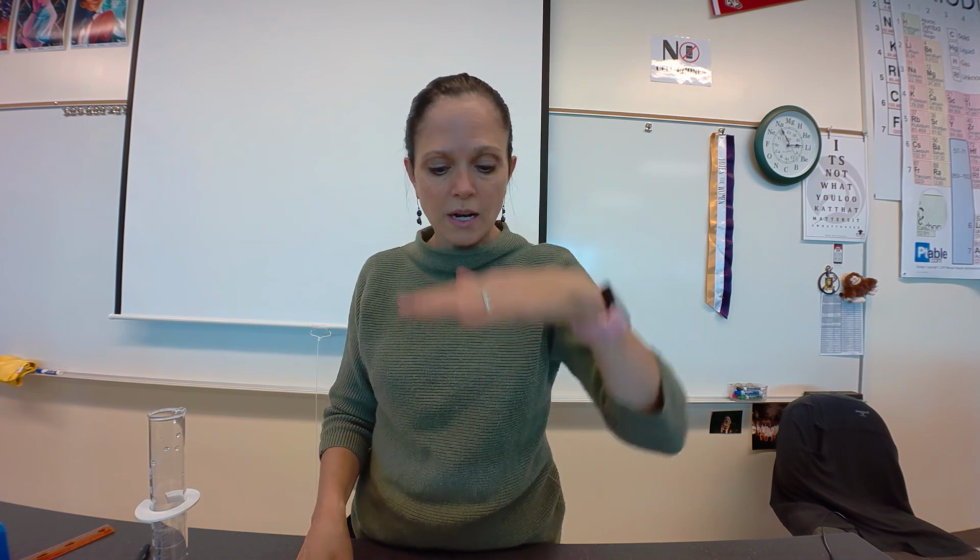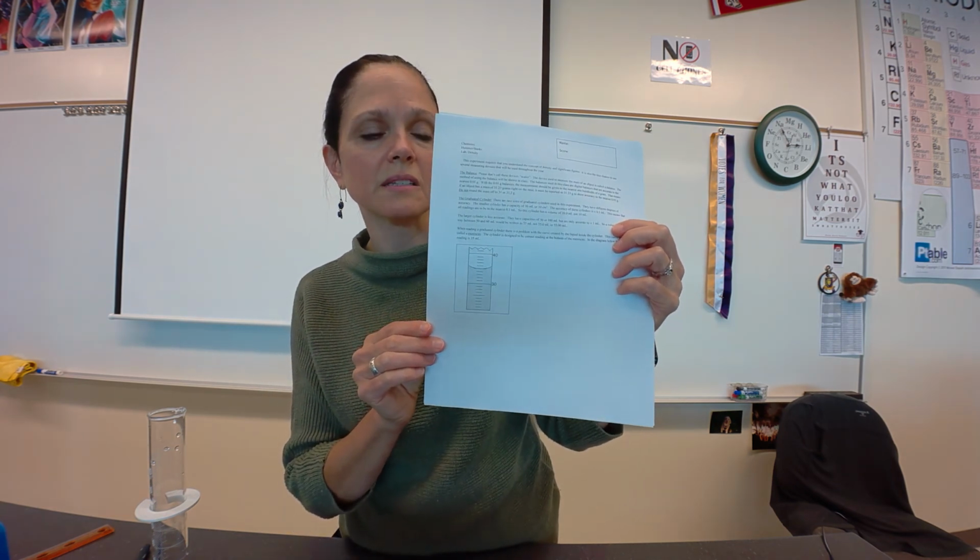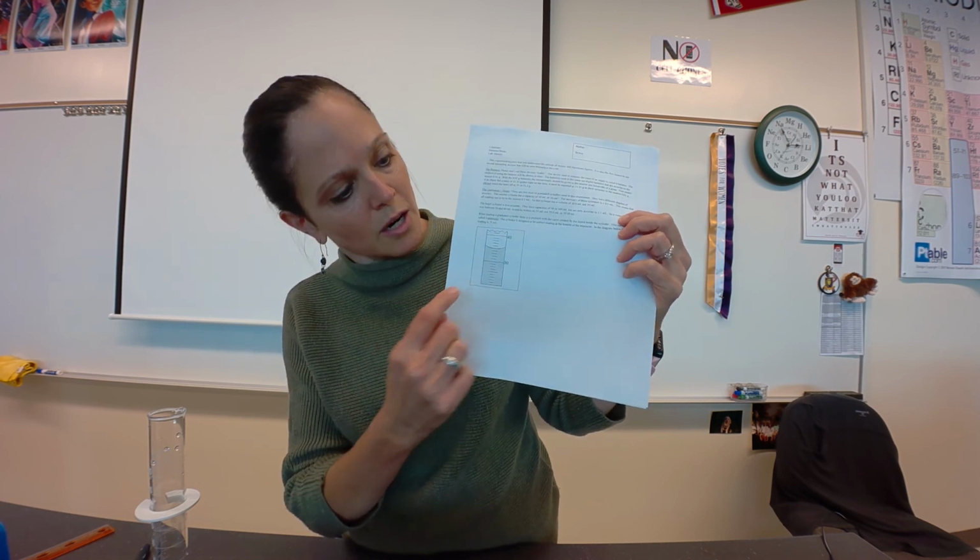Now, if you remember, in graduated cylinders, water does not go straight across. This graphic does a good job. It creates an arc, and that arc we call a meniscus. So every time we read a graduated cylinder, we are going to read at the bottom of the meniscus. That makes it consistent, and that's how we are going to read, okay?